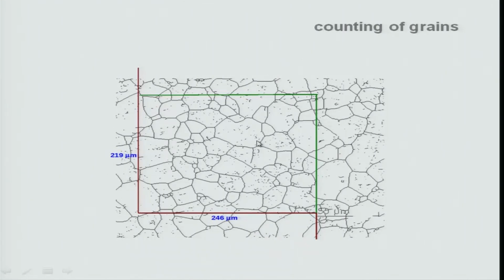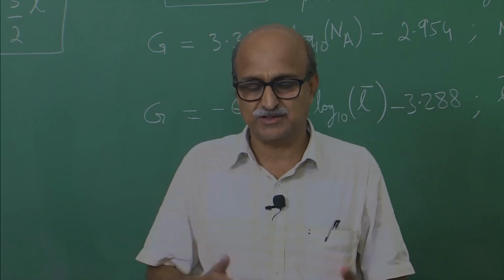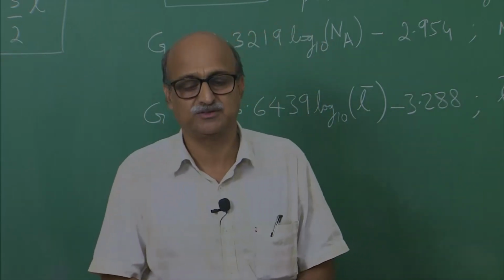Within this mask, I am going to count grains in such a way that I get an unbiased count. Now, what is the problem at hand when we are counting grains? The problem is as follows: grains which are completely inside can be counted as whole, but what do we do with the grains which intersect with the boundaries? How much or how big a part of that grain do we count? So, this methodology describes a technique for counting, so that I get a statistically unbiased estimate.